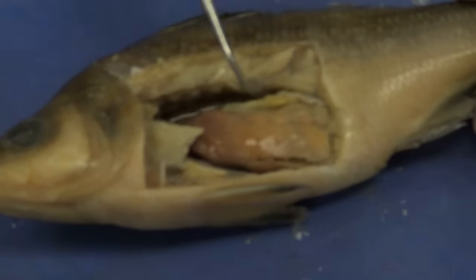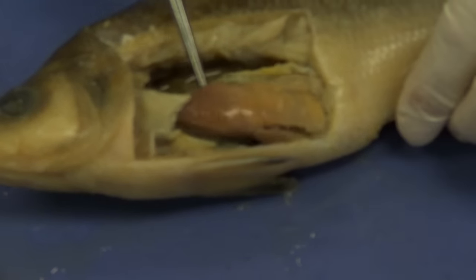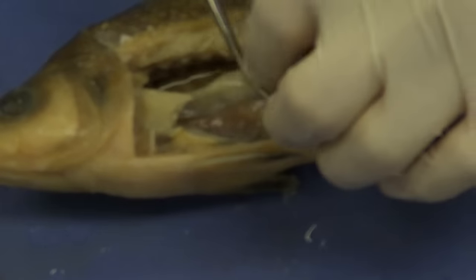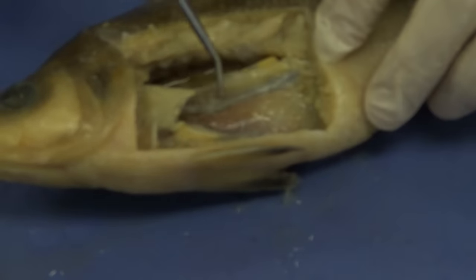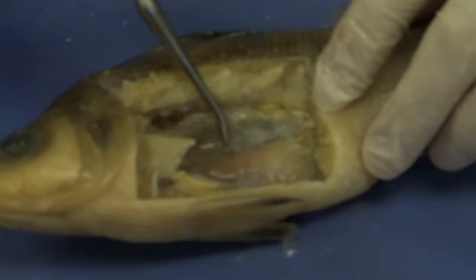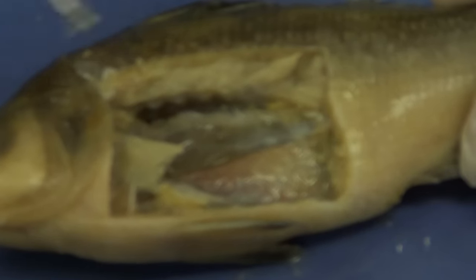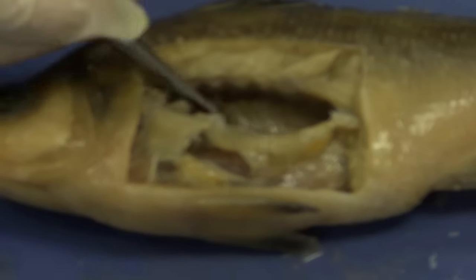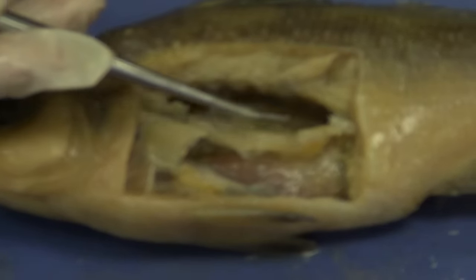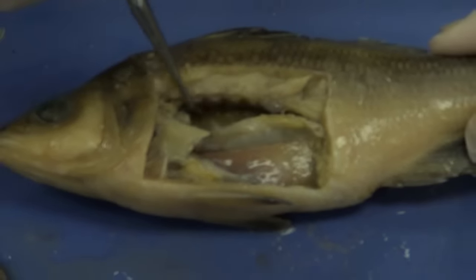This is going to be the gonad. Since this is a male, that would be the testes. The male actually has two testes, so if I remove this one I can see another one below. The female only has one — she has one ovary, and typically there are a lot of eggs in it. Again, you can see that swim bladder right there — this whole structure is the swim bladder.